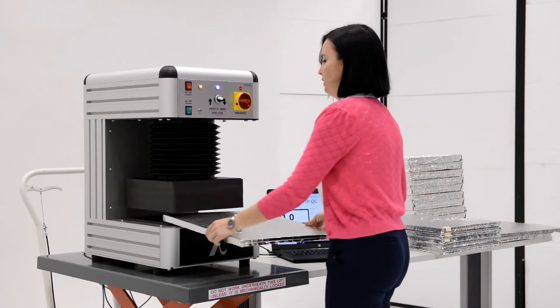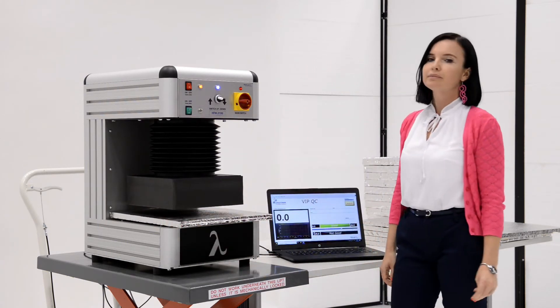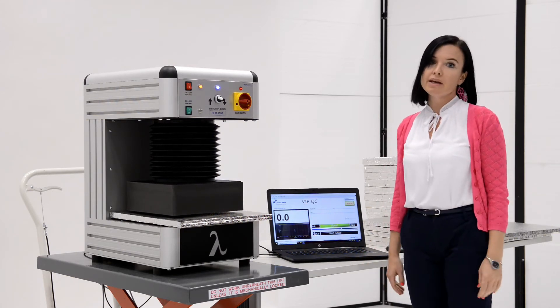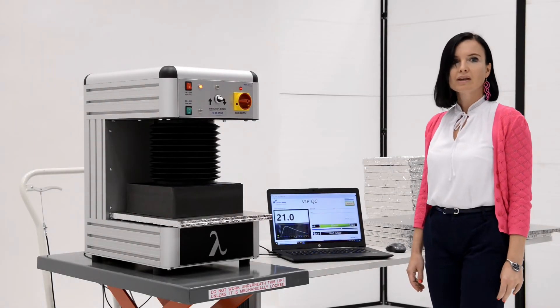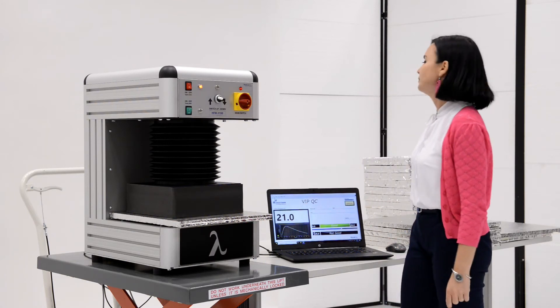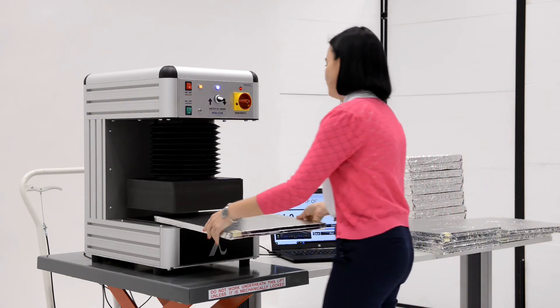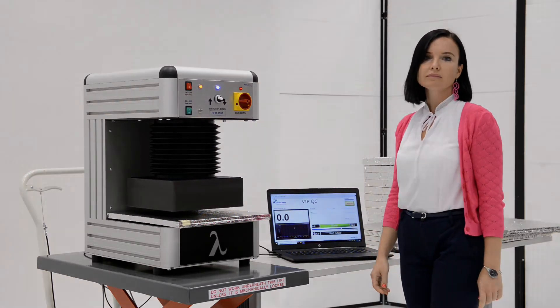Insert the next sample and press start. We repeat the same procedure with the remaining panels. The duration of each test takes approximately 30 seconds. This panel is also marked as good.